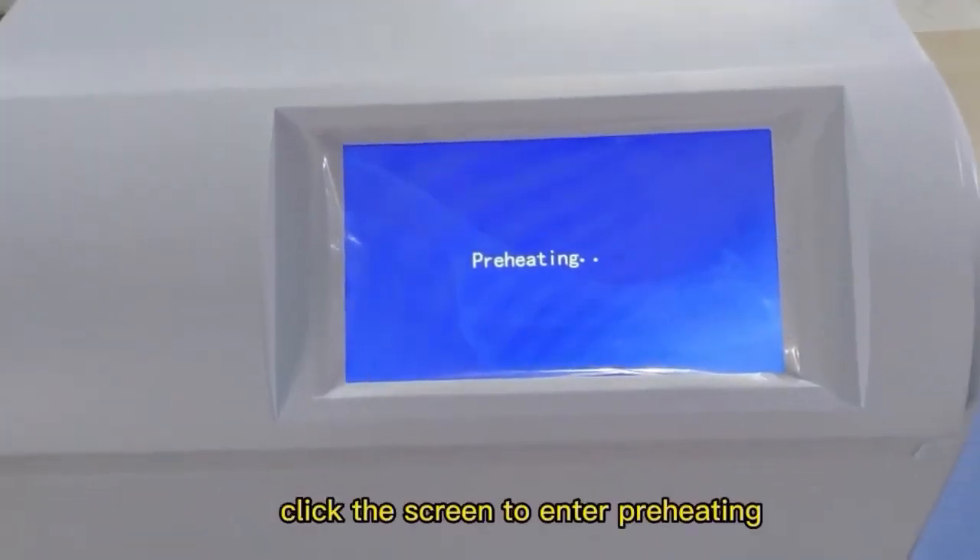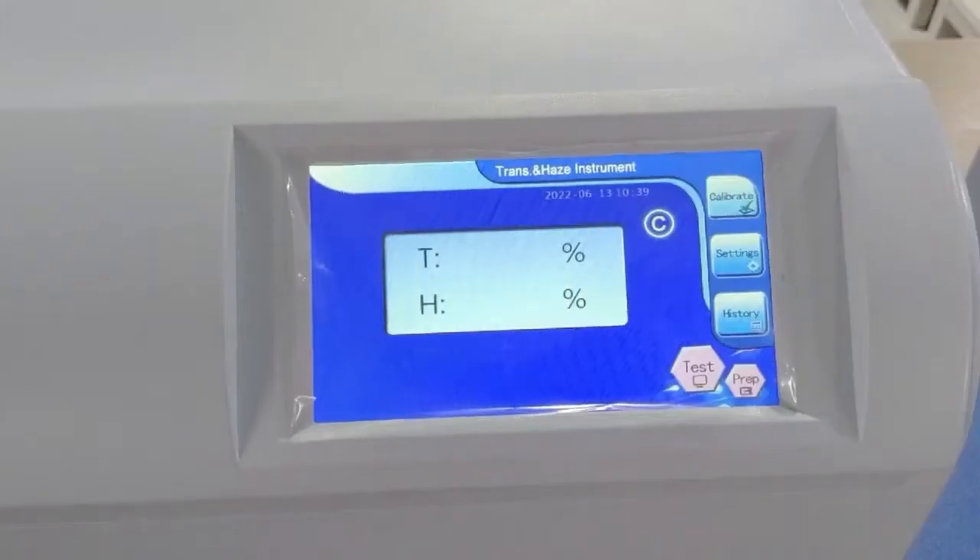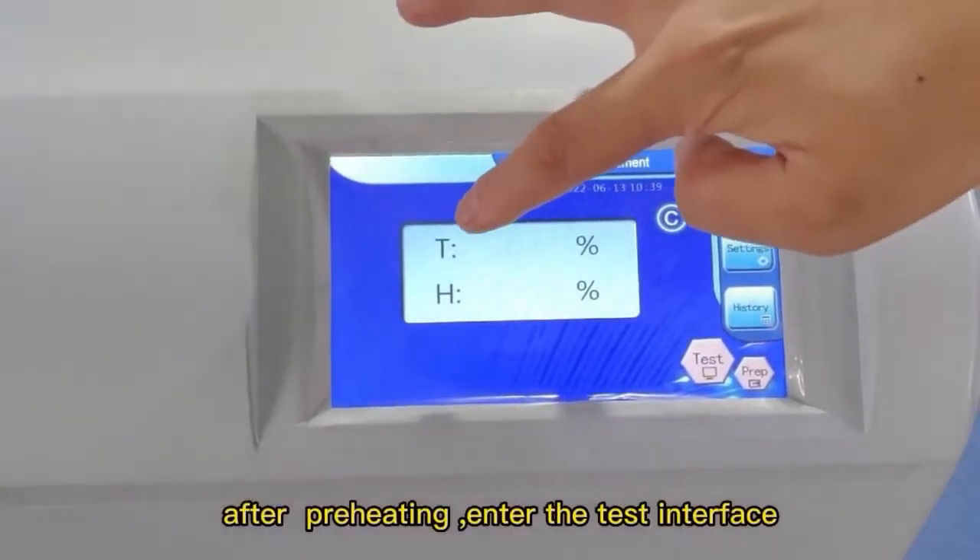Click the screen to enter preheating. After preheating, enter the test interface.